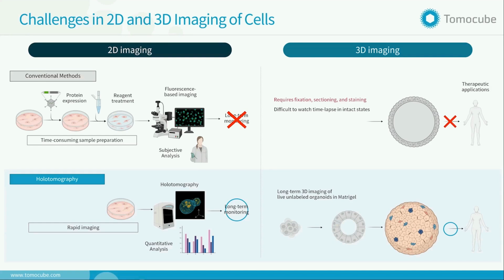And furthermore, you can also perform long-term imaging because we do not worry about phototoxicity and the modification of cells. You can measure cell behavior for days and weeks, compared to conventional methods that only measure up to a few hours limitation. And now we see the 3D complicated biologies.